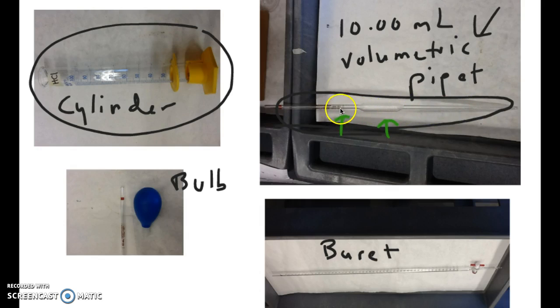There's actually only one mark, and that mark is located right here. That mark corresponds to 10 milliliters. So if you get your liquid up to this height, then that would correspond to 10 milliliters. Specifically in this case 10.00, because that's the precision given by the manufacturer of this volumetric pipette.